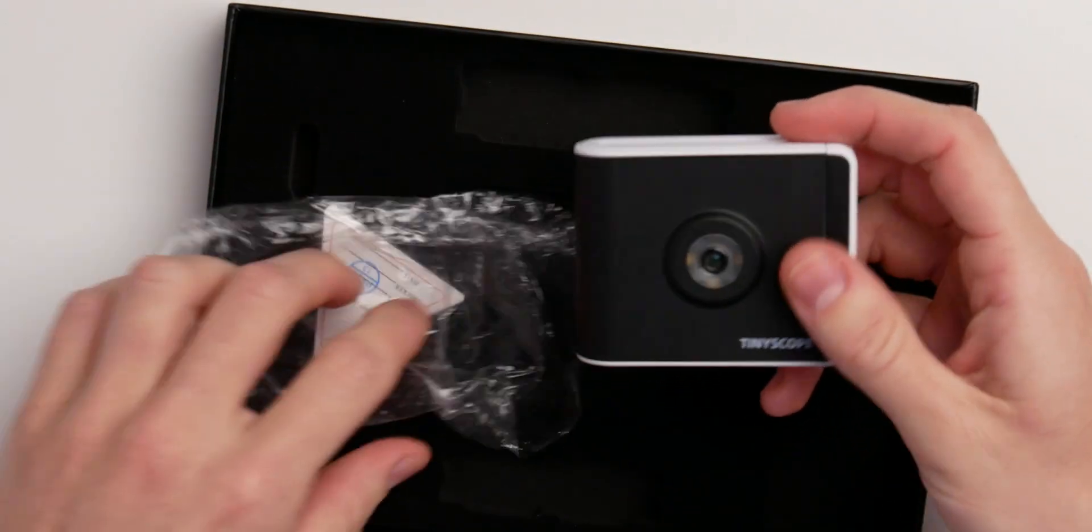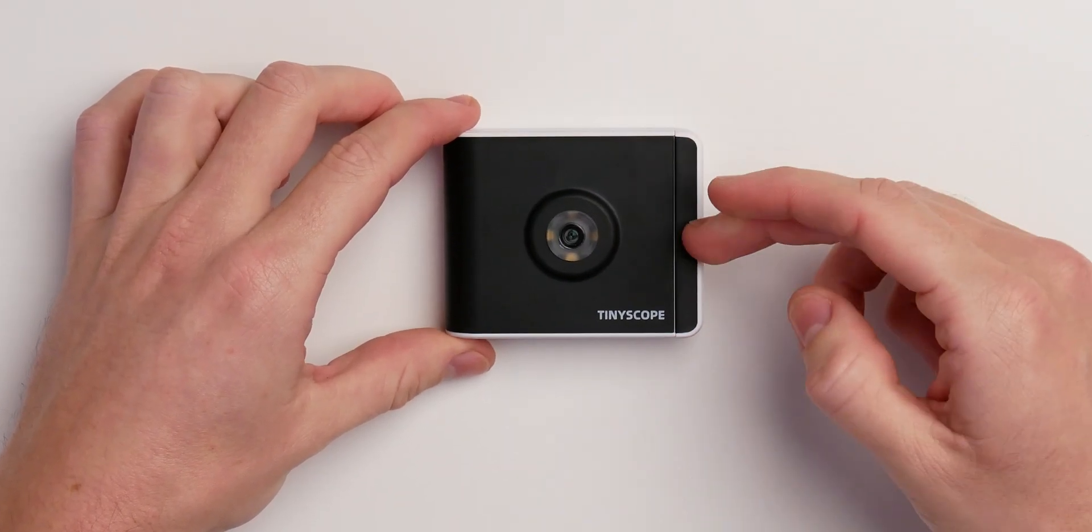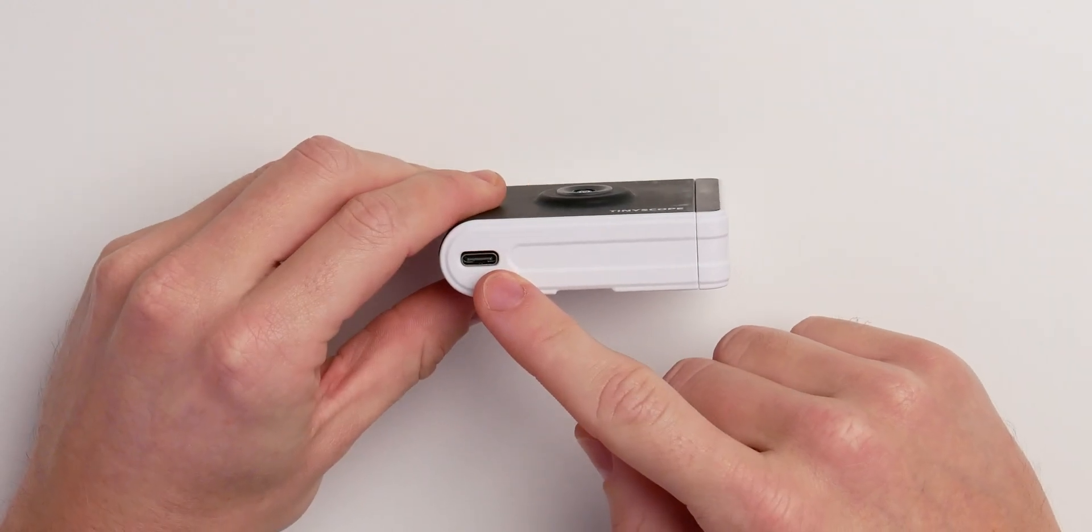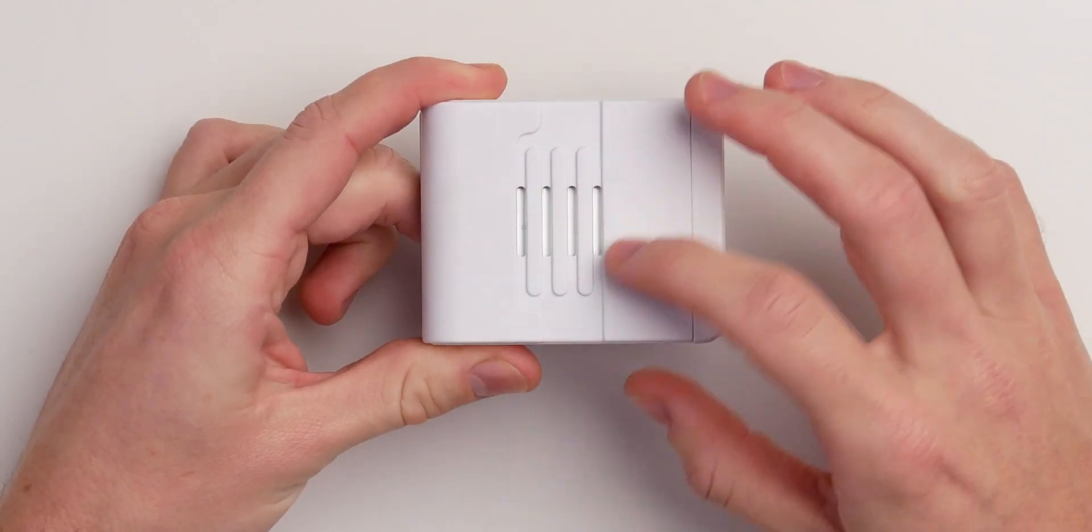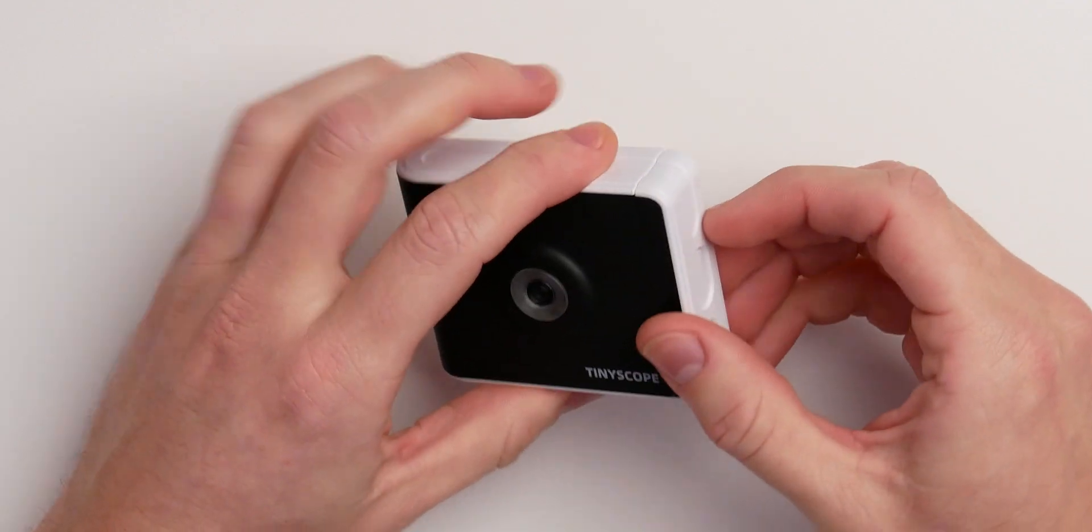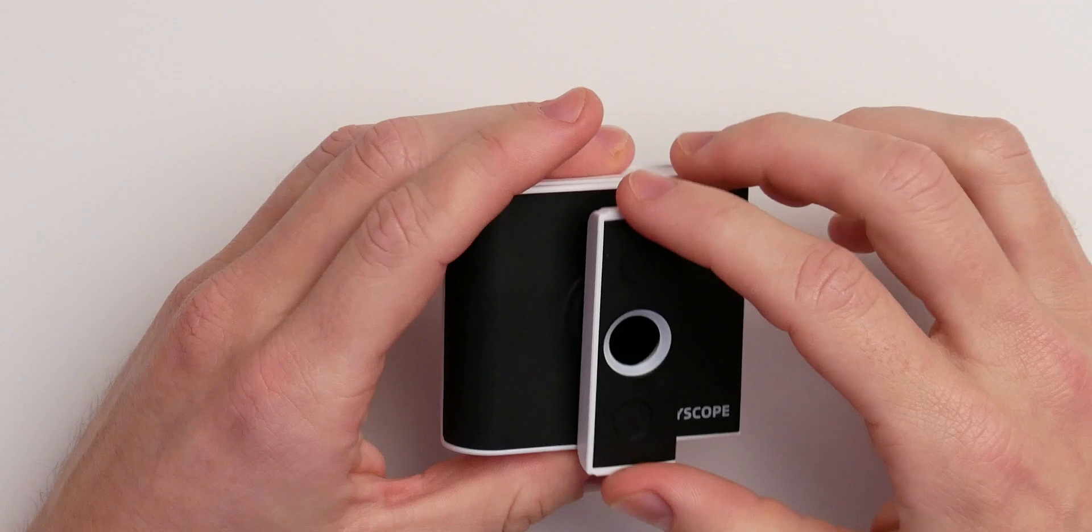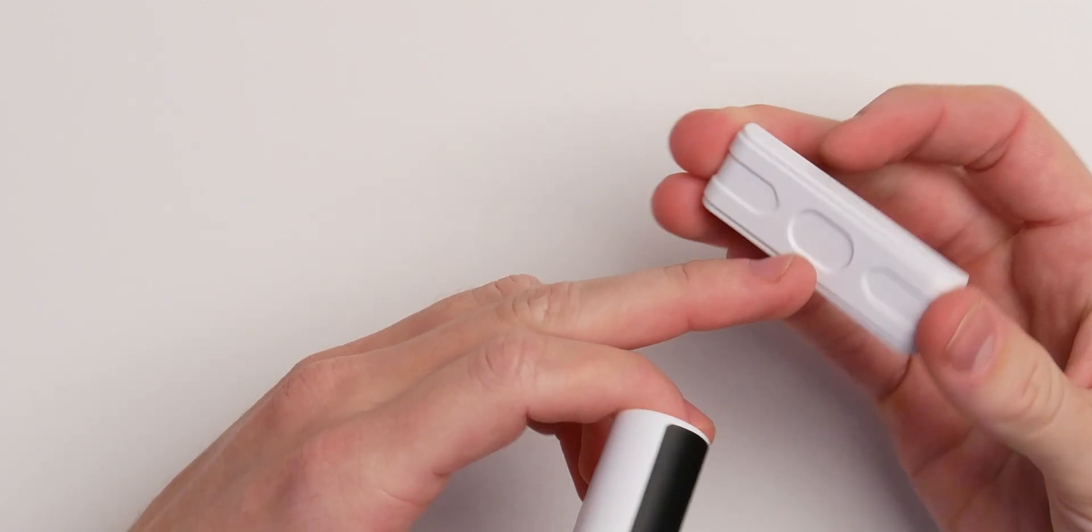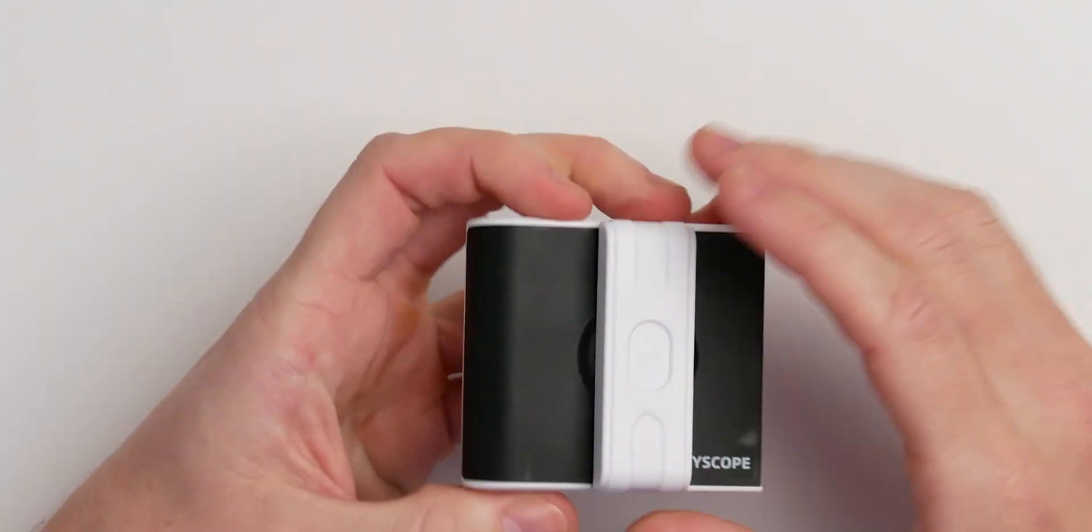Last but not least we have the camera itself. And that's just everything. So this is the complete camera, everything you need to know. We have an LED ring here in the front, USB Type-C for power and for data. A little bit of metal and ventilation holes you could say. Nothing on this side, nothing on this side. And here you can just pop this off, this is magnetically attached. And you just have the chance to fix the probe on the microscope like this for the white side and also a black backdrop like this.